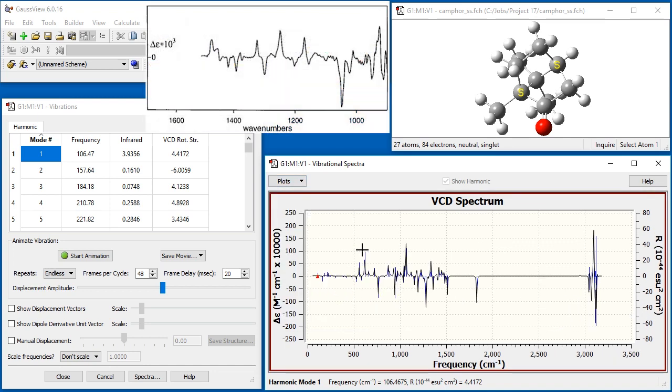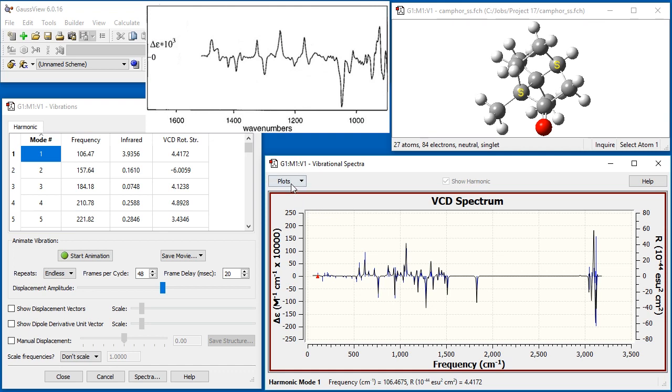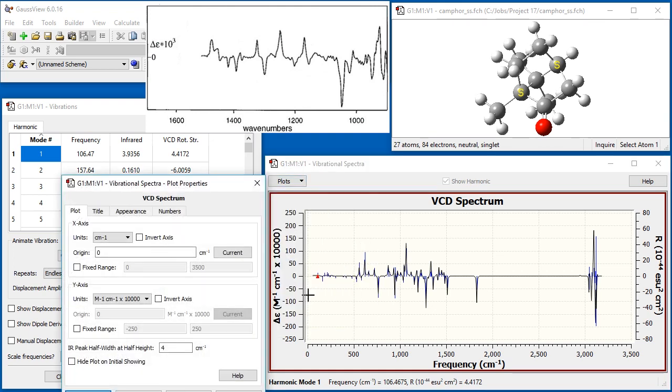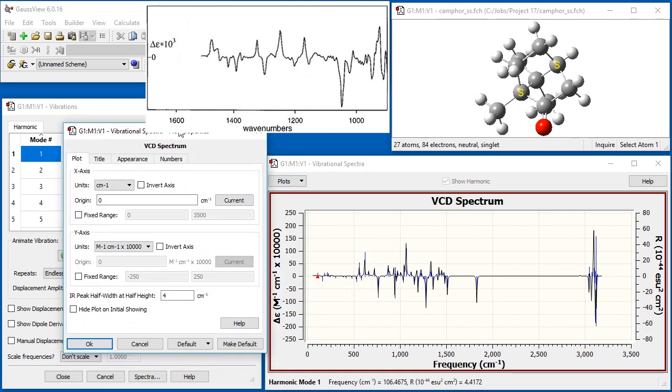This is the experimental VCD spectrum to which we will compare our results, in order to determine the absolute configuration of the experimental Camphor sample. GaussView's plot presents the predicted spectrum in a different format, but we can modify the display to match what the instrument produced.